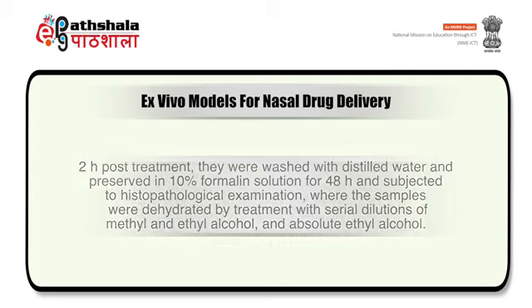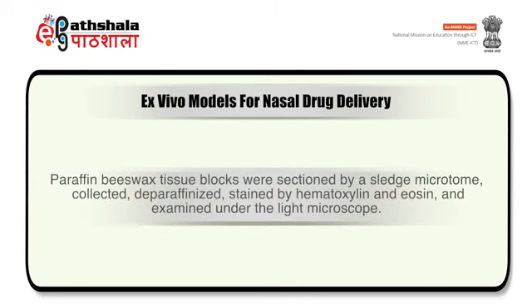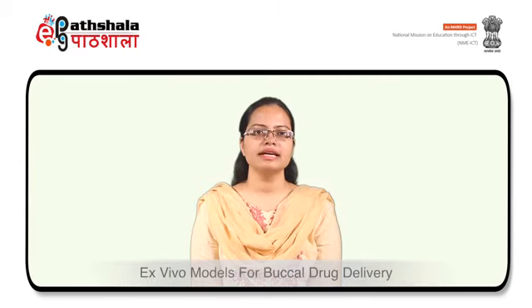absolute ethyl alcohol. Specimens were cleared in xylene, embedded in paraffin in a hot air oven with temperature adjusted at 56 degrees centigrade, and the samples were kept for 24 hours. Paraffin beeswax tissue blocks were sectioned by a sledge microtome, collected, deparaffinized, stained by hematoxylin and eosin, and examined under the light microscope. The next are the ex vivo models for buccal drug delivery.